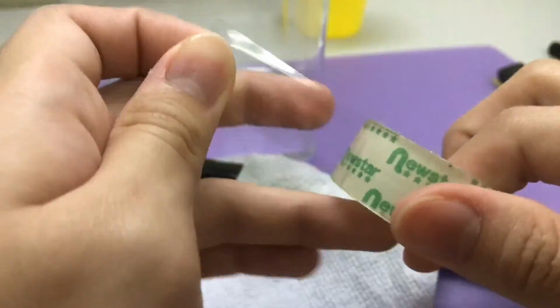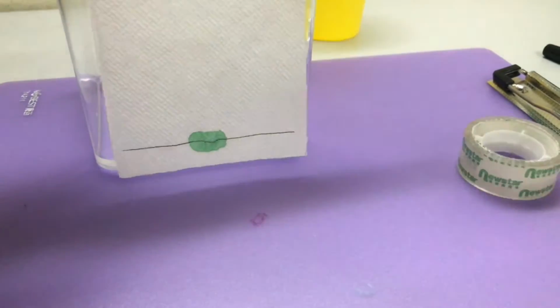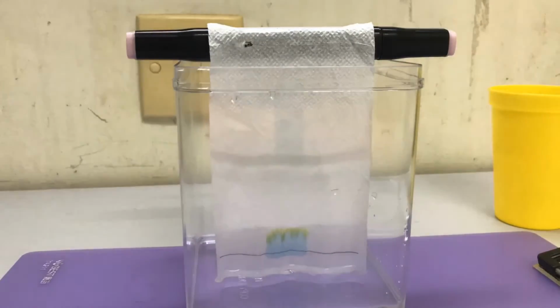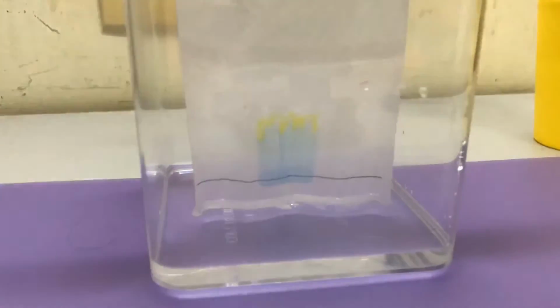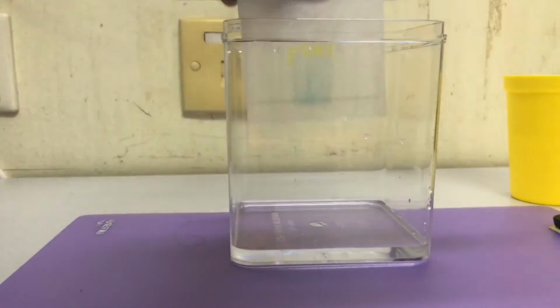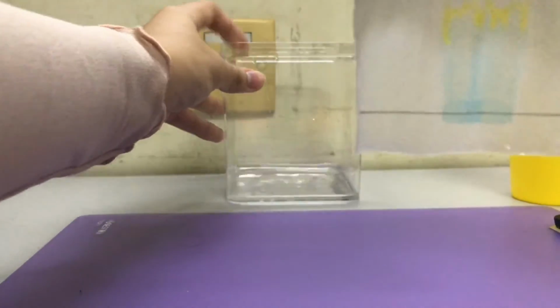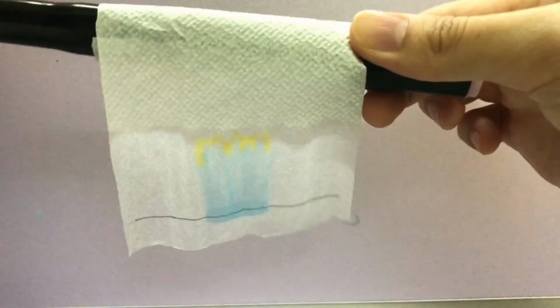The tissue paper, the support, is attached to another support to prevent it from being submerged completely into the water. Depending on their polarity, the solvent dissolves the molecules present in the mixture as it rises up the paper. The solvent continues to rise up the tissue paper. Molecules of each pigment leave the solution at different places because of different polarity. Hence, every pigment rises to a particular level on the chromatograph on the paper and gets separated in the process. So this is the blue one separated from the yellow one.